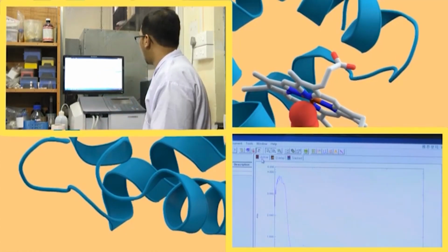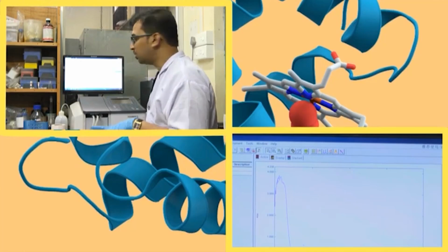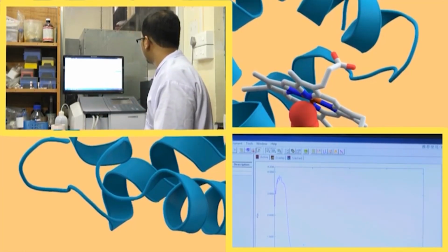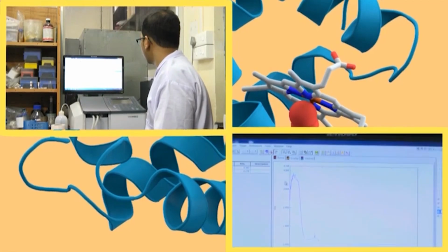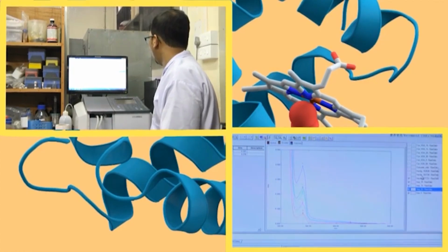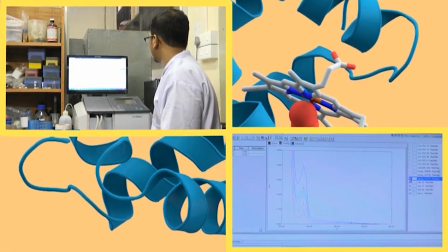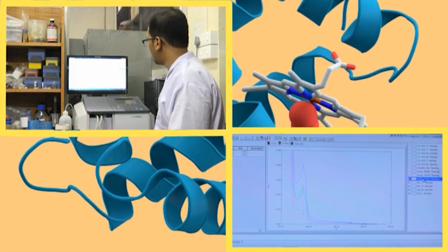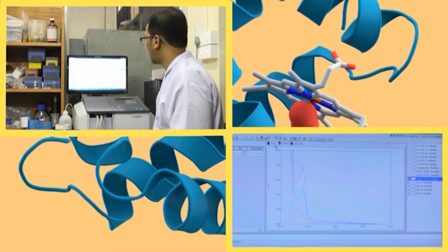The active part is the one we are actually monitoring, currently HSA 30. If we double click on this line, the violet line, and come to active, we can see it has turned to the green line.